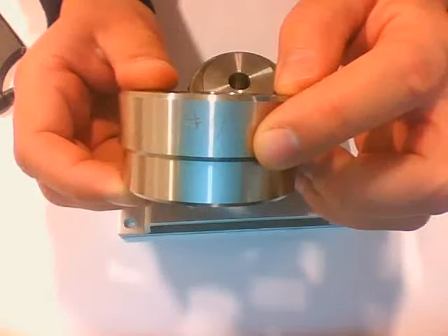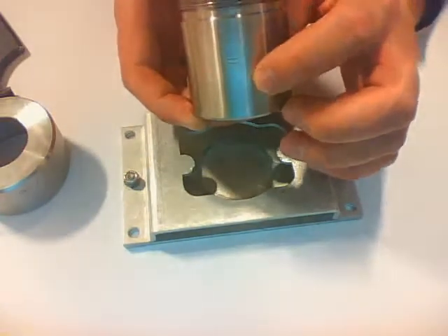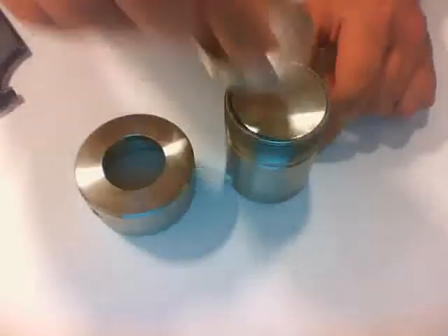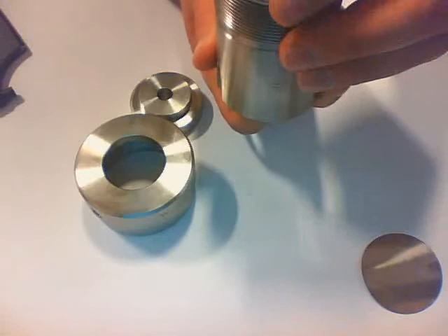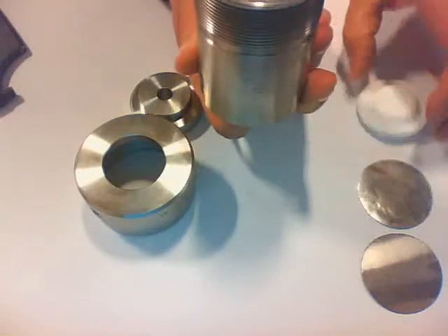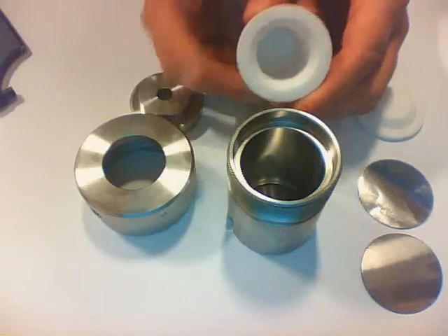The lid and the body each have a specific matching number — here it says number 13 on the lid and number 13 on the body — and these two always have to go together as a pair and should not be mixed. Now that I've taken the lid off, I can take the insert out, and by pushing my finger at the bottom I can remove the burst diaphragm and the corrosion foil. Check that they are intact, then take off the teflon lid, push out the teflon body, and take out the sample.